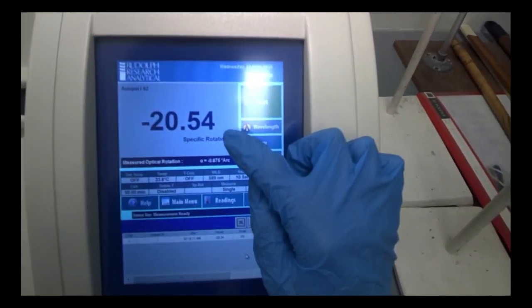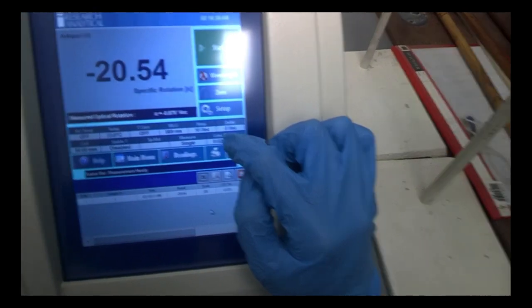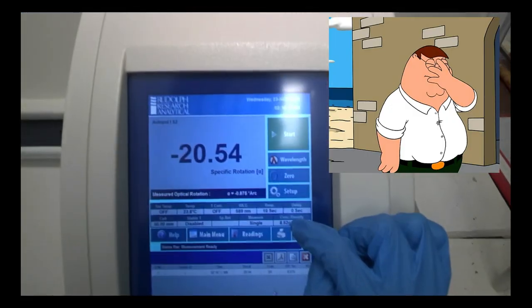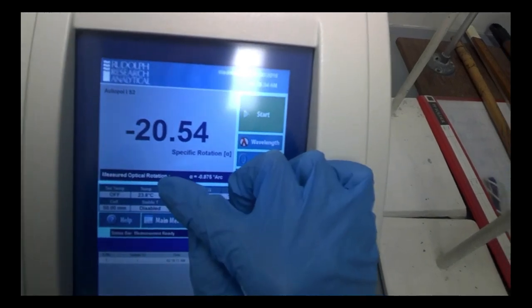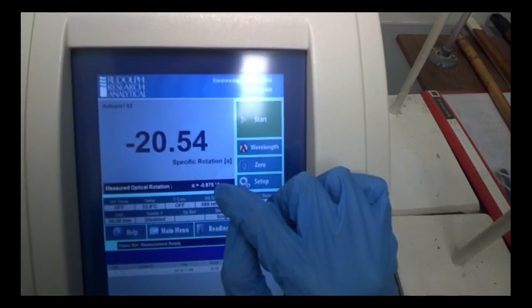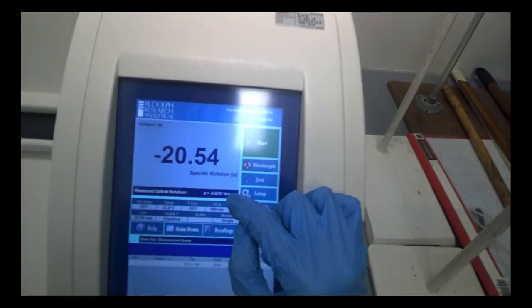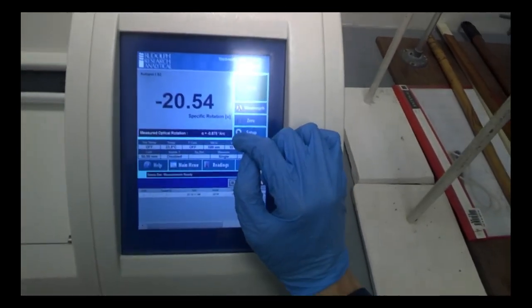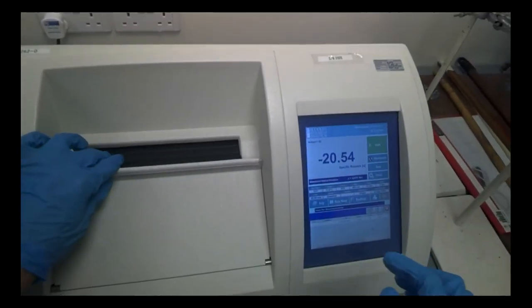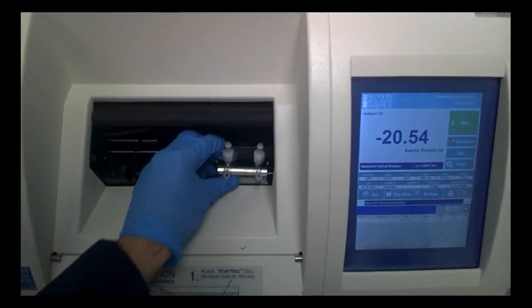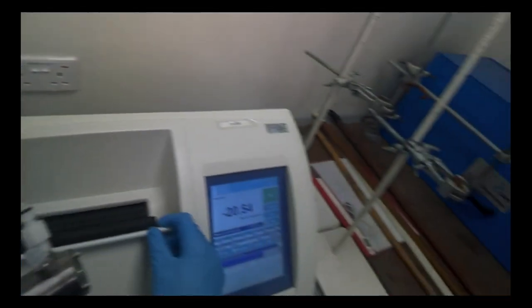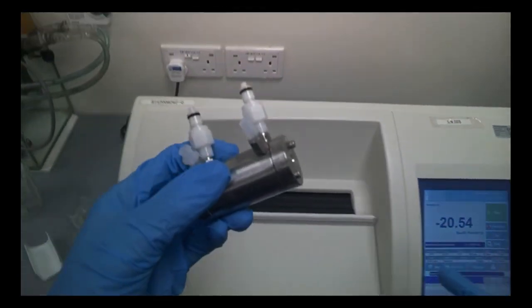Now suppose you know that the concentration is different from what you keyed in, or the previous user has set something else and you forgot, not to worry. You just have to refresh the optical rotation value, the one in the UI, so we can find out using a formula to link them up to find a value. So at the end of the day, what you do is it's good to do an averaging and repeating your sample into the polarimetric cell and scan and see what is the optical rotation.